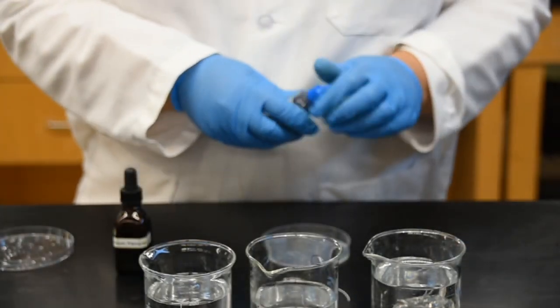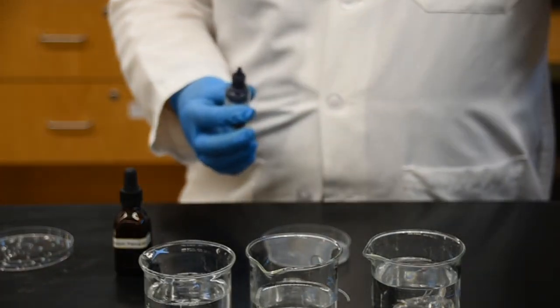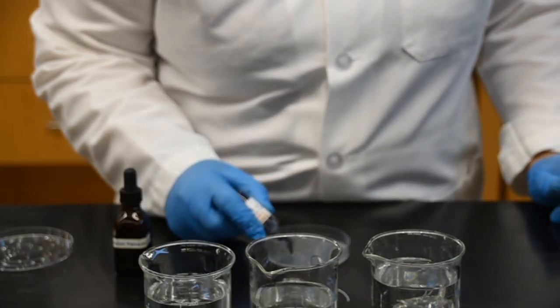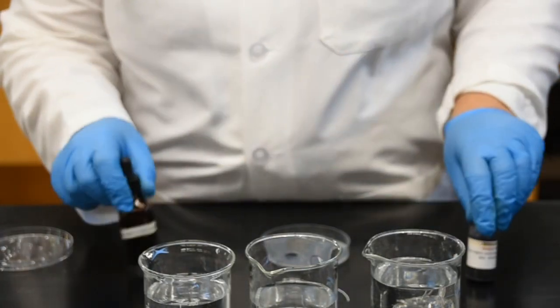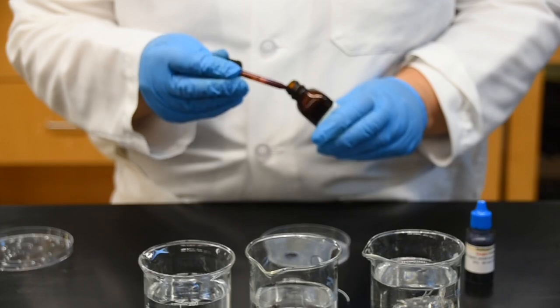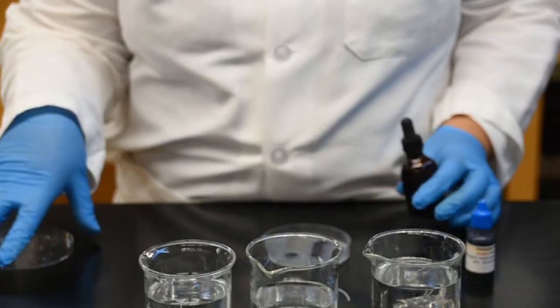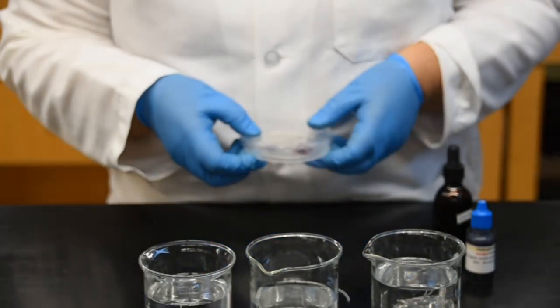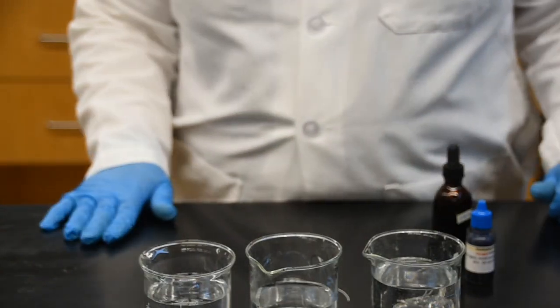So I'm going to just start with my potassium permanganate, and you guys don't really need to label anywhere because the color is very distinct. So I'm going to add a small drop of my potassium permanganate to one, and again I'm going to add a drop of methylene blue to one, and then the potassium permanganate to my other openings, and then just let the sample sit, and let's see how fast these samples are going to diffuse. So again, 45 minutes for this sample.